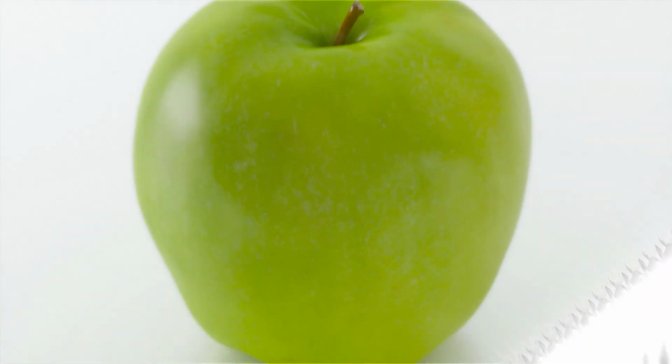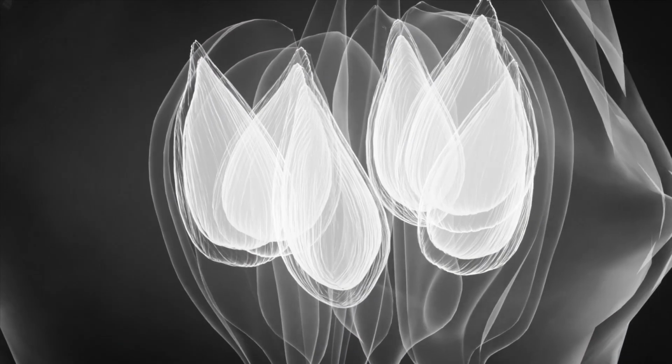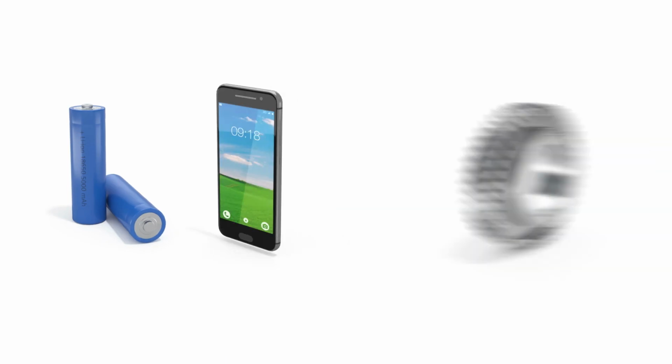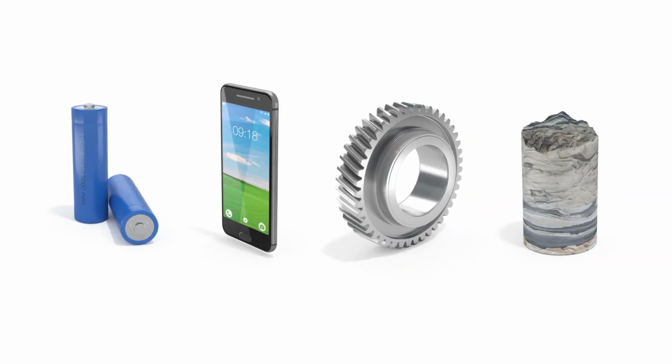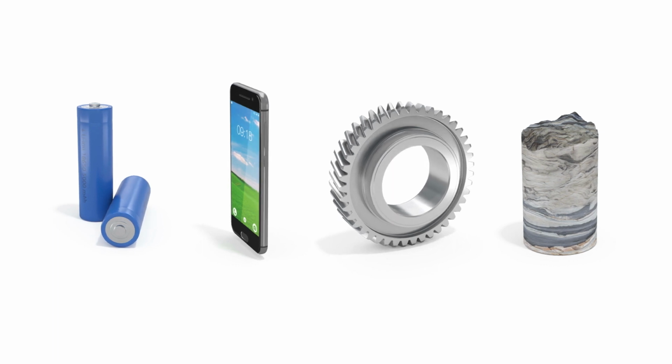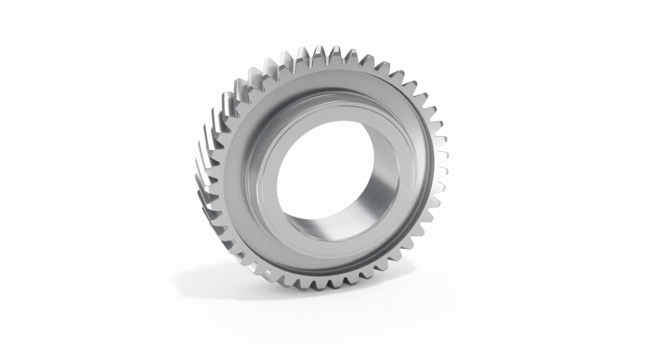Resolution at a distance is the ability to image an apple seed at submicron resolution without having to cut the apple into pieces. Many research advancements might not be possible without the ability to non-destructively analyze hidden details at high resolution. For example, additive manufacturing.